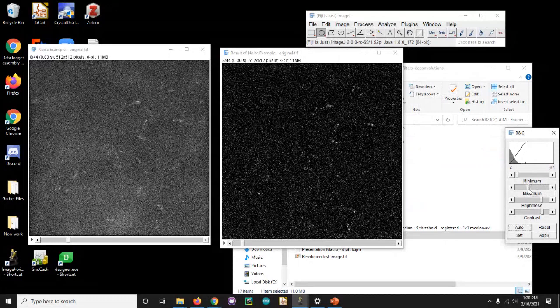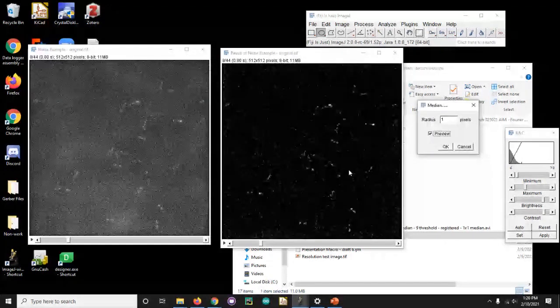Yeah, so what we're going to try and do is remove those outliers. So you can go to filters, median. You can see 3 does a really good job, but we always want to go as low as possible. You can see 2 is also doing a pretty good job. You try 1, and 1's just fusing it together. It's not even really removing it. It's leaving too much behind. So I'm going to go ahead with 2.